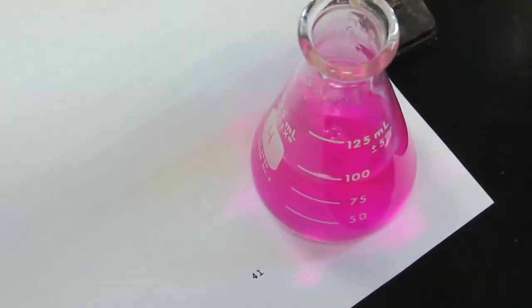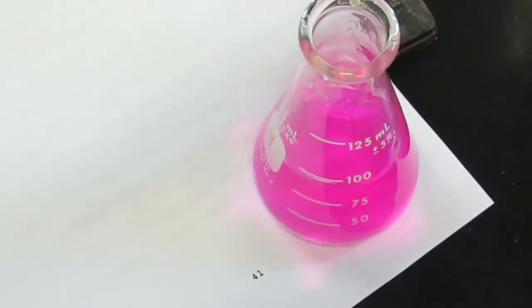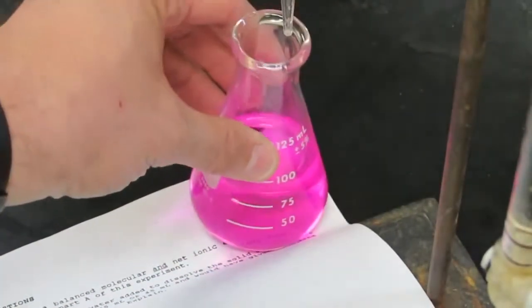So I've overshot my endpoint. Please do not discard your solution. If you overshoot your endpoint, you can just add more acid. Remember, we haven't taken a final acid reading yet, so I'm just going to add a little bit of acid here.